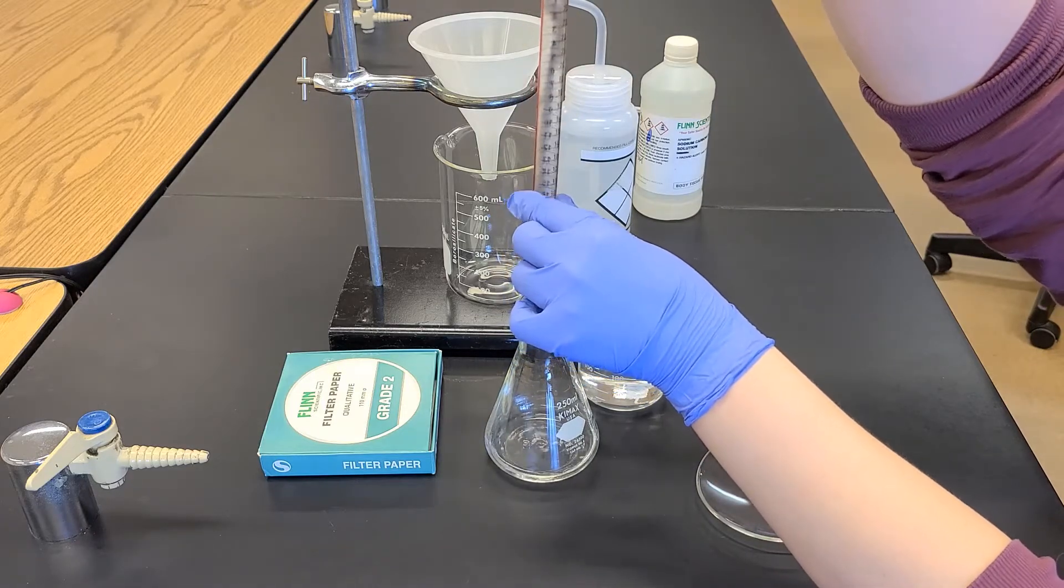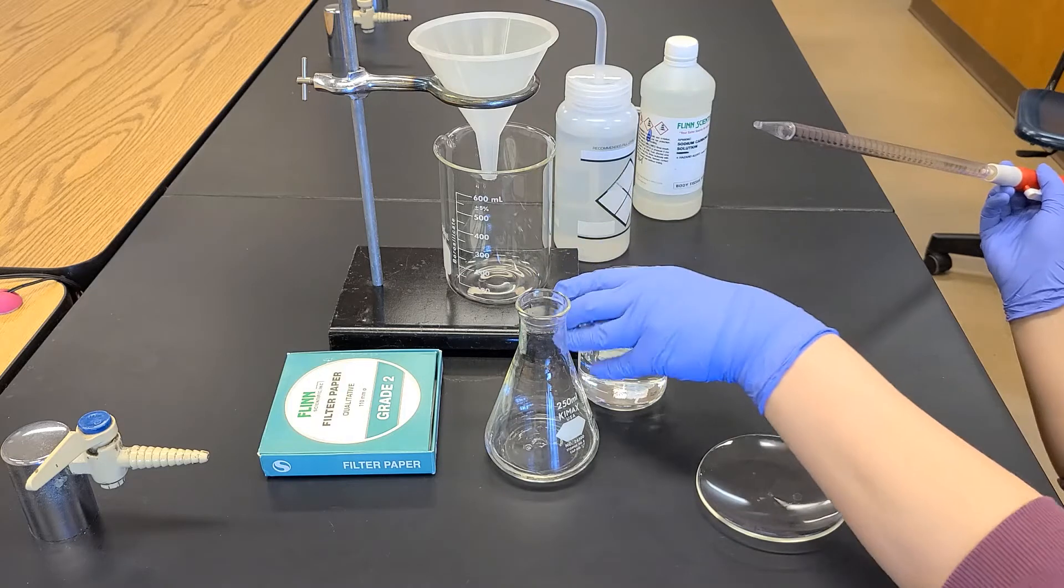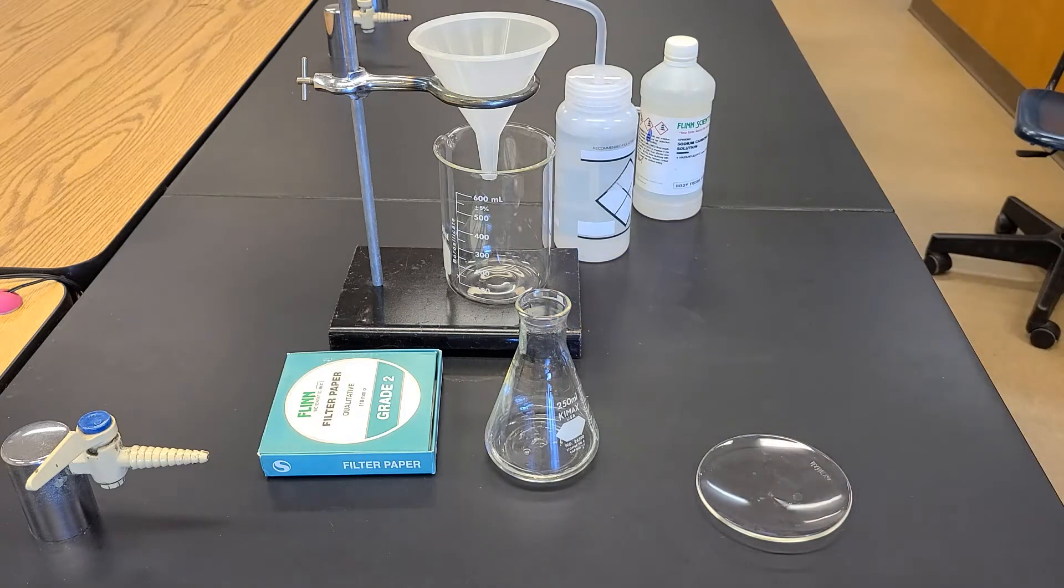We're using a flask in this case because I can swirl it without risking having the liquid escape the flask.